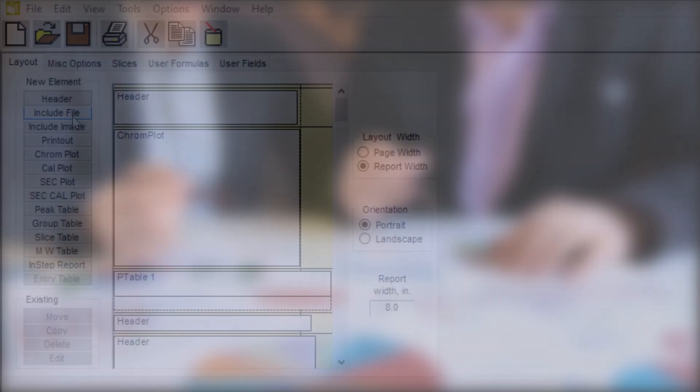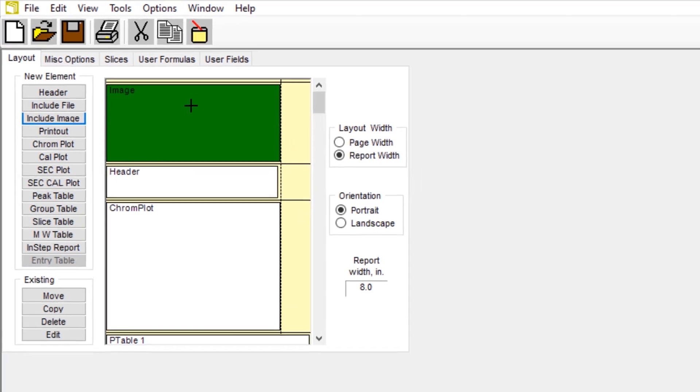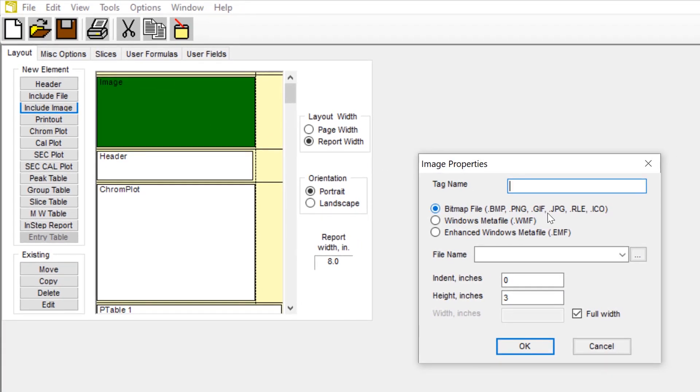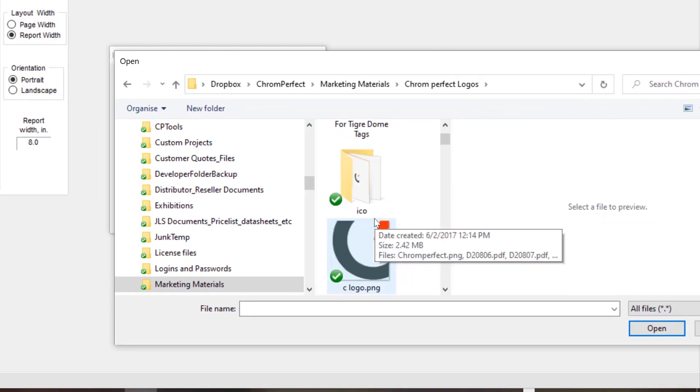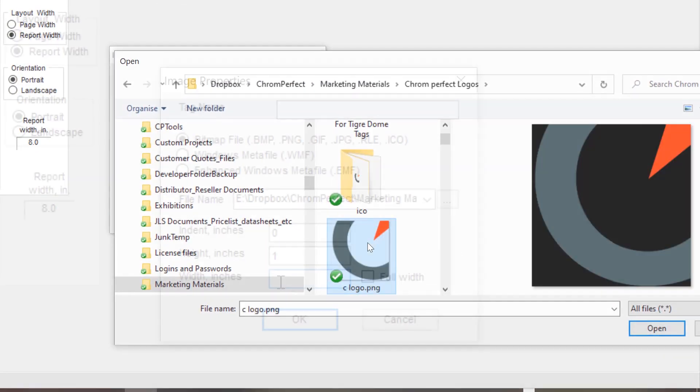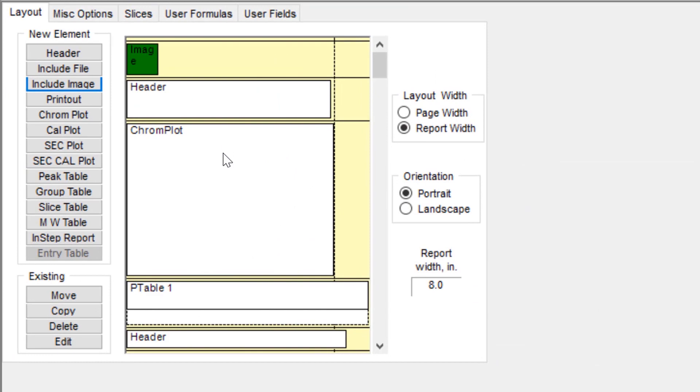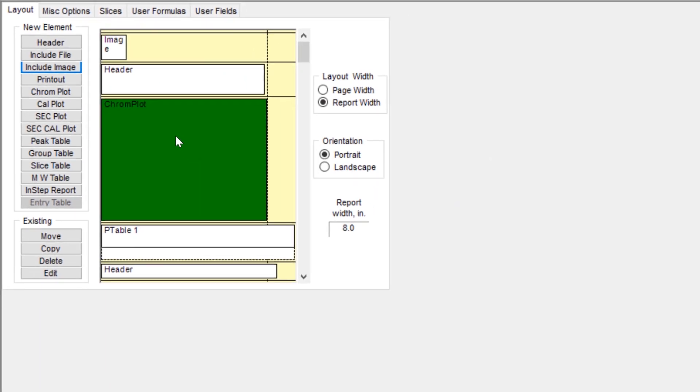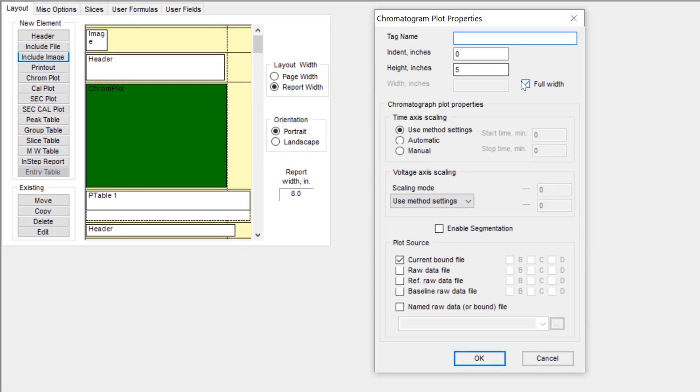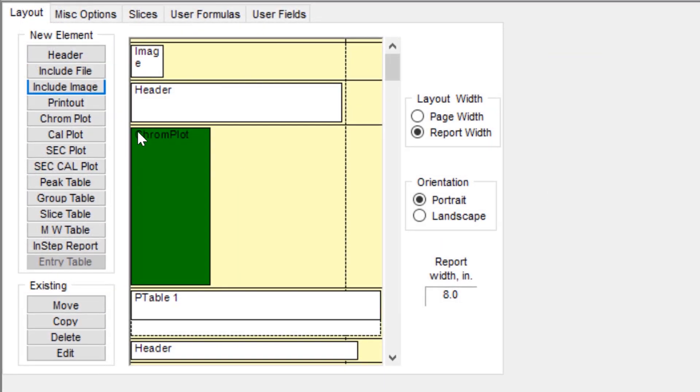Building a new report template is straightforward via the simple user interface. You can drag and drop elements onto the virtual page. In just a couple of minutes, add images, company logos, multiple chromatograms, and calibration plots.